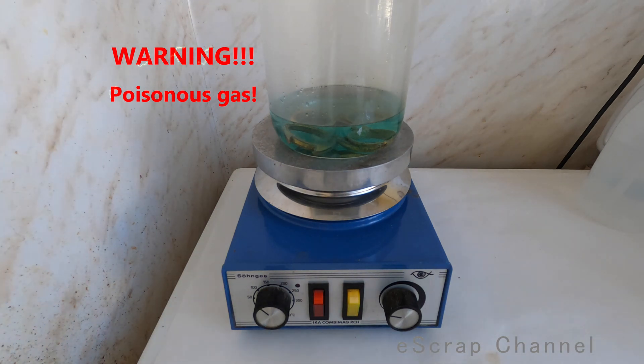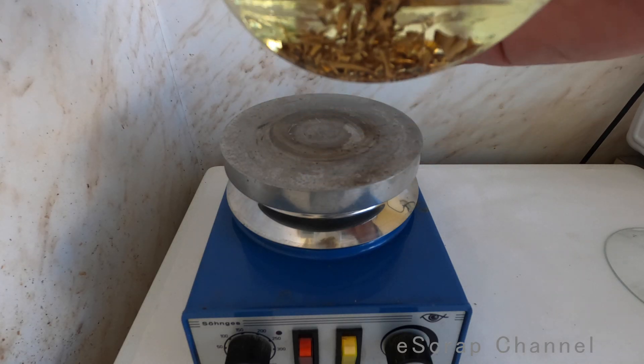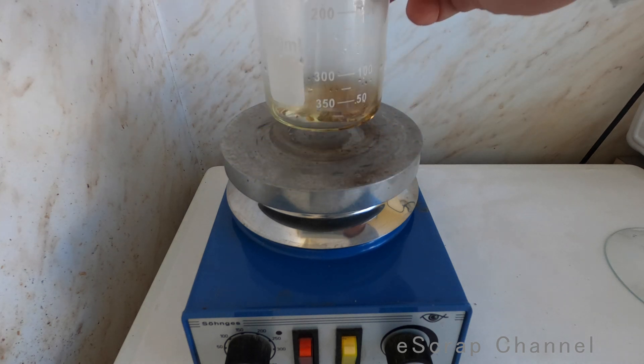The reaction is progressing. Now let's get the gold foils from the two watch cases and transfer them into this beaker.